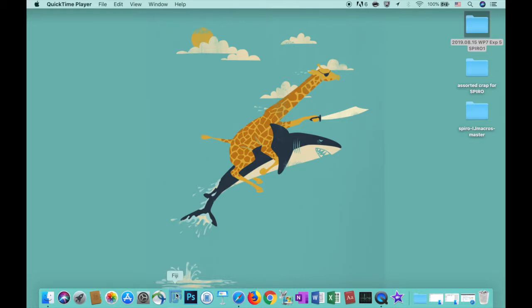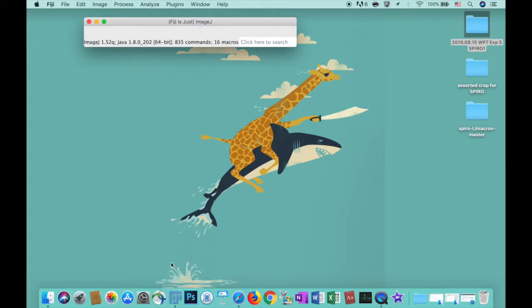Thirdly, please make sure that your computer doesn't go to sleep mode during macro run. Otherwise, macro will be paused. So you need to tweak the power settings on your computer before you start the macro.